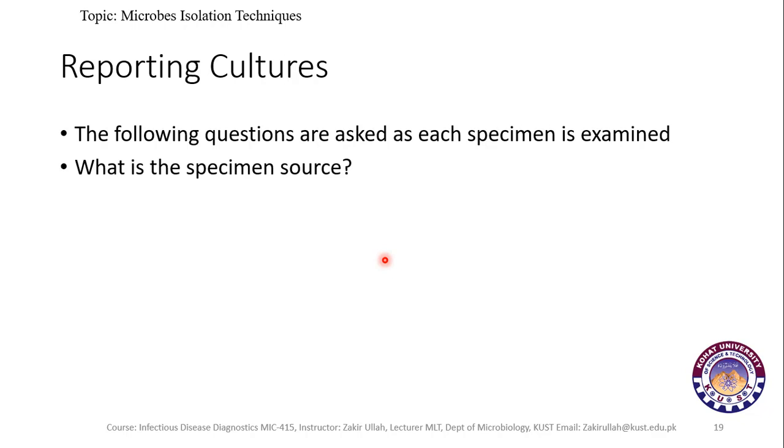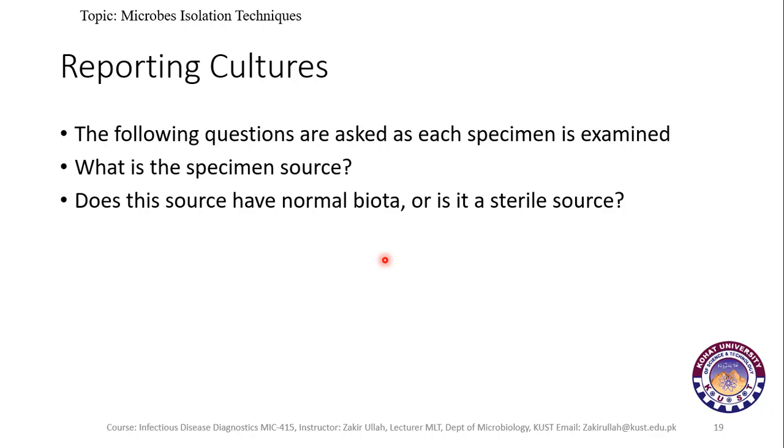The specimen source also helps us in finding the suspected microorganisms which usually produce infections at these sites, and whether this source has normal biota or is sterile, as I discussed earlier.